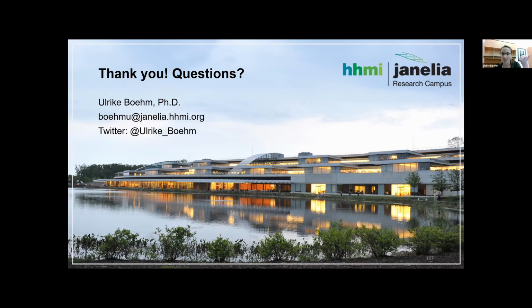So you have the technological part, you have the sample prep part, but you also have the analysis part, and so on and so forth. So first of all, I do think that the analysis side will, over the next couple of years, actually improve quite strongly. Also, the last aspect of the talk, with the DECODE software, where we are more and more able to handle big data sets in a more reliable and more satisfying way in order to analyze.